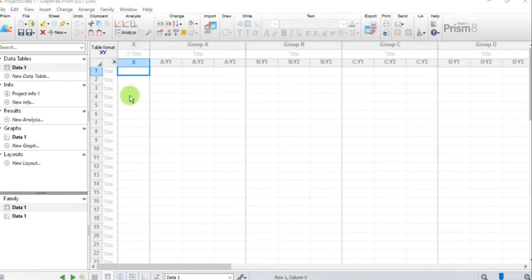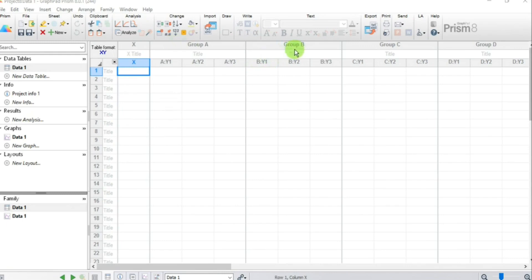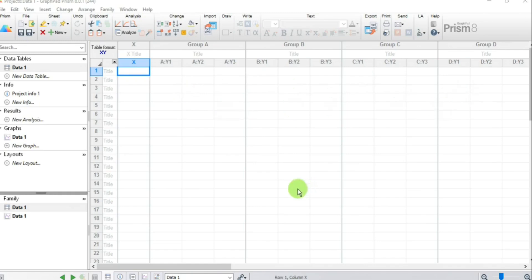This is our X column where we plot our X values or concentrations from Excel. For the Y axis we have Group A, Group B, and so on. Since we have only one agonist we put our values in Group A only. If we had multiple agonists we could make use of the remaining columns.